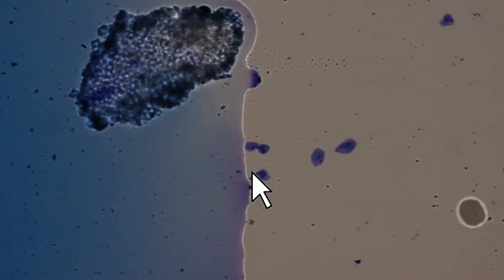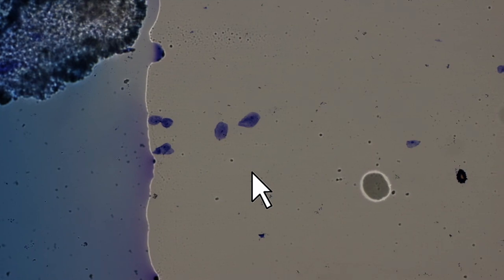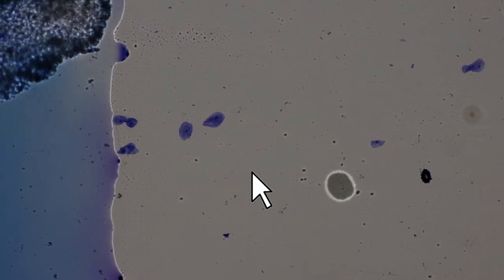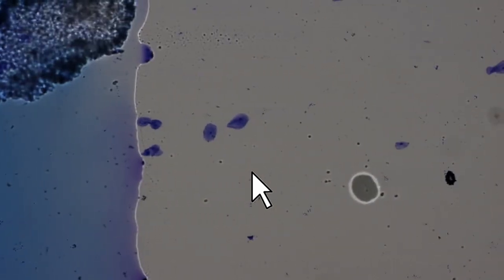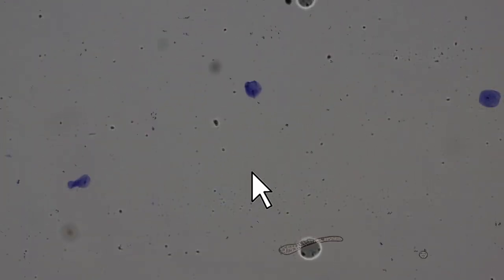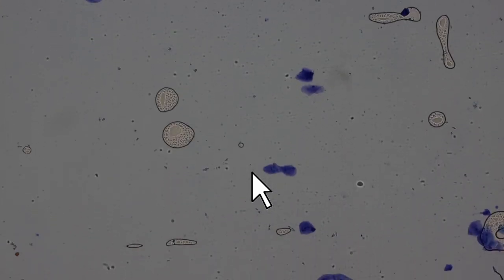And this is now the methylene blue which has moved below the cover glass, but it's so thin, this layer, this film, that the background does not appear to be blue. And that's why the cells have been stained. By the way, this is now the 10 times magnifying objective. So what I'm going to be doing now is I'm just going to go up with the magnification.